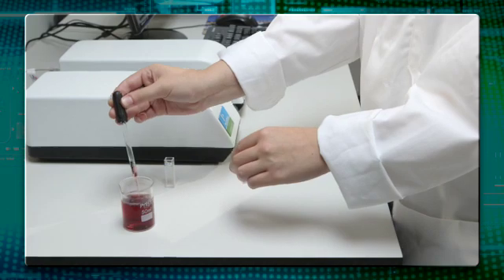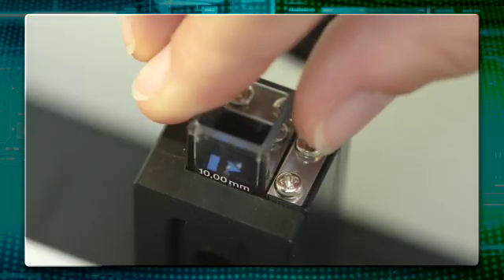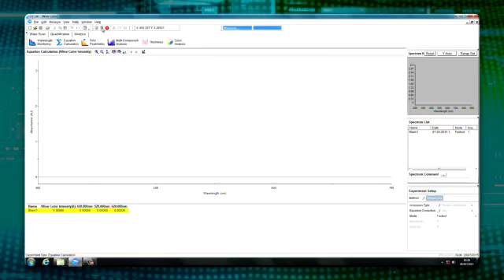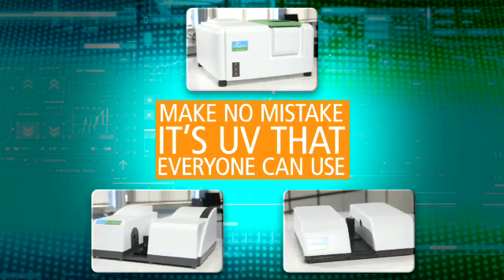Whatever the demands of your lab for material analysis, the Lambda family of instruments maximizes your lab's efficiency now and in the future as your needs grow. Make no mistake, it's UV everyone can use.